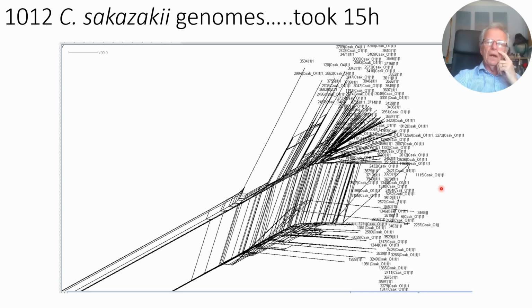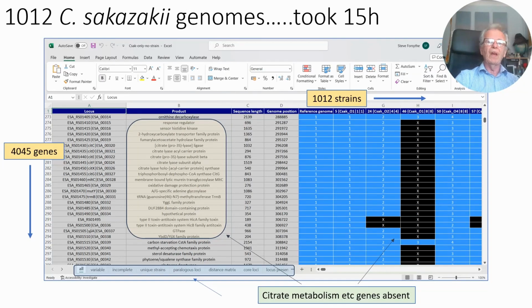And here's a really interesting group of ST1s, complex one, where in actual fact we've got two branches in parallel, and then we've got this bifurcating going on, or division going on. And again, one can zoom in there and have a good look at what's going on and what's driving that diversity. Just zooming in a little bit more, just giving you an example.